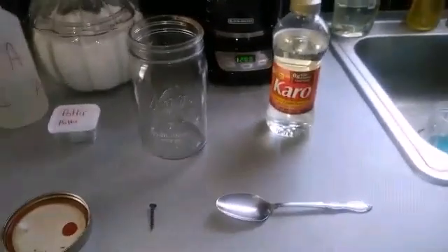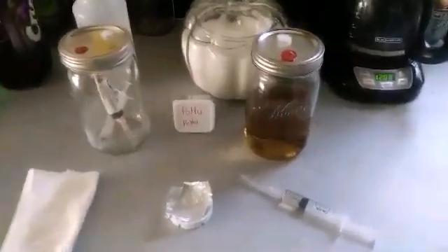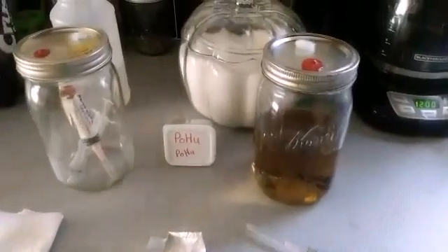I got my Karo corn syrup in there. See how I filled it up between the two words on the jar — about that far. I threw in a drywall screw — you probably can't see it. Now I'm going to pressure cook this.